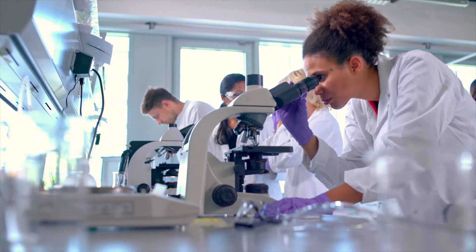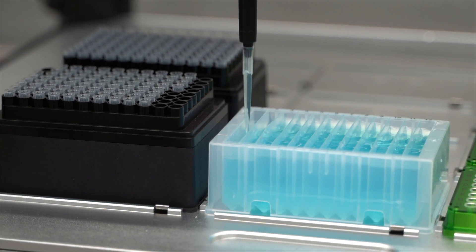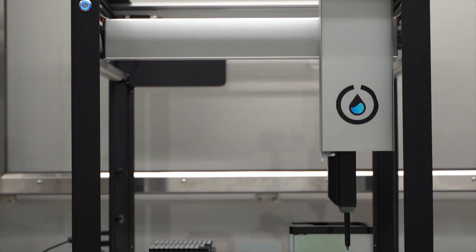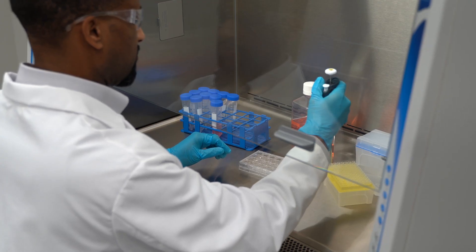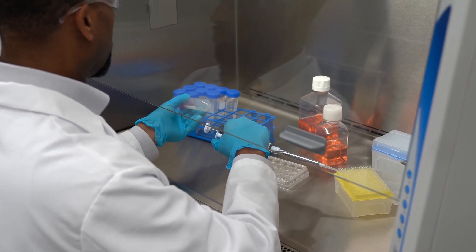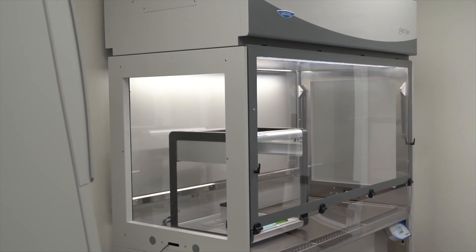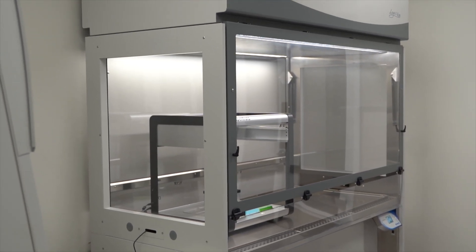Laboratories handling biohazardous samples with automated instruments such as liquid handlers or cell sorters require larger Class II biosafety enclosures. Traditional biosafety cabinets are built for researchers, so they don't have features required for large instruments such as a spacious interior or multiple access points into the enclosure.